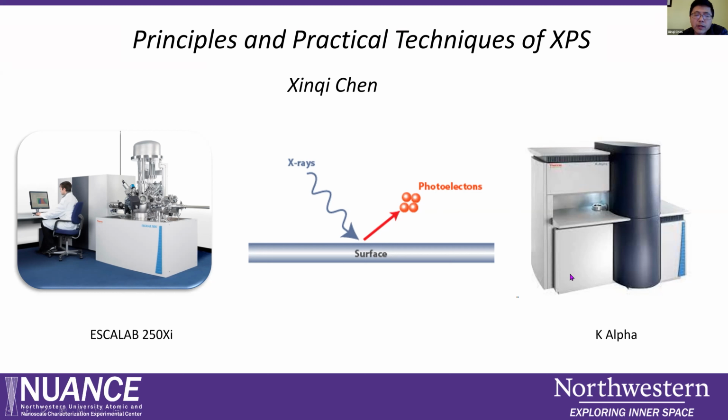We hope we can get another one, because if you look at the schedule, the XPS is quite busy every day, booked from early morning till night. We hope that by the end of this year we can get another XPS. For regular routine XPS analysis, we use this instrument. For advanced XPS analysis, you can use this one. We hope we can get something new.